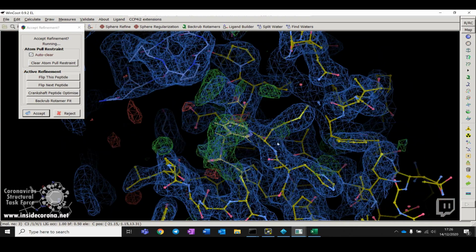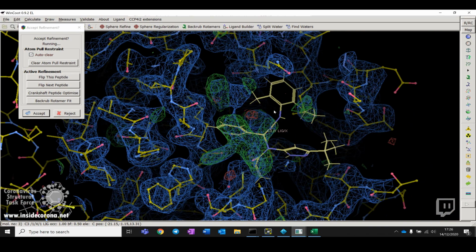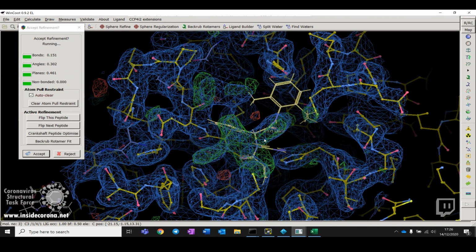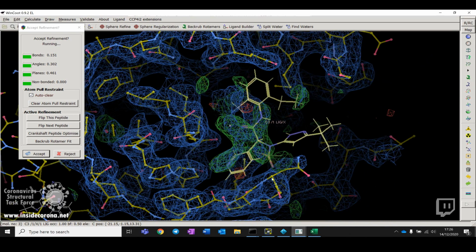It's not wanting to cooperate right now. Okay, so we've got that just about in the right place, but all of this stuff over here is completely in the wrong place. We need to try and drag this around here so it picks up this bit of density.